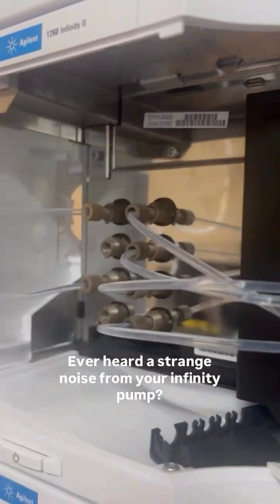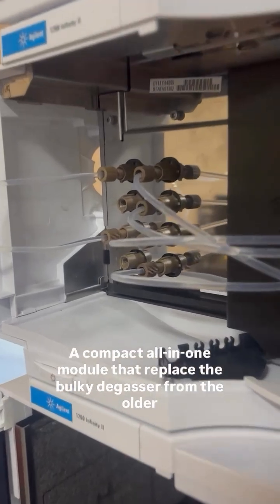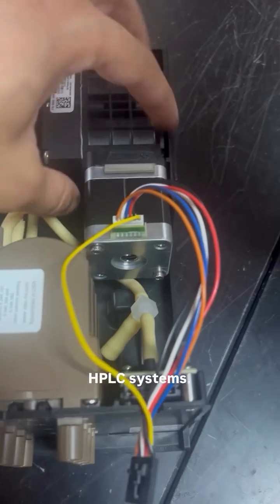Ever heard a strange noise from your infinity pump? That sound might be coming from the integrated degasser, a compact all-in-one module that replaced the bulky degassers from the older HPLC systems.